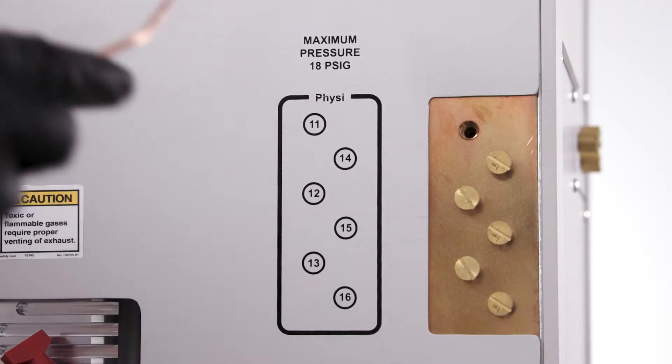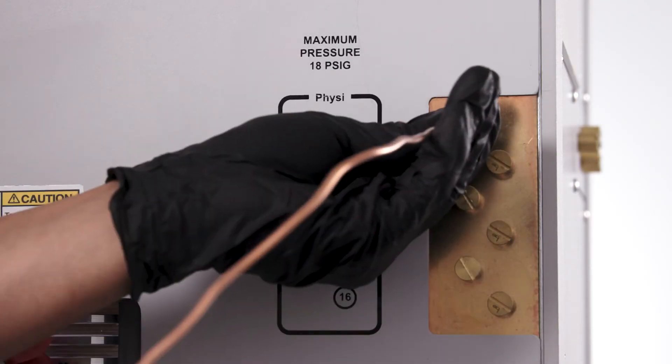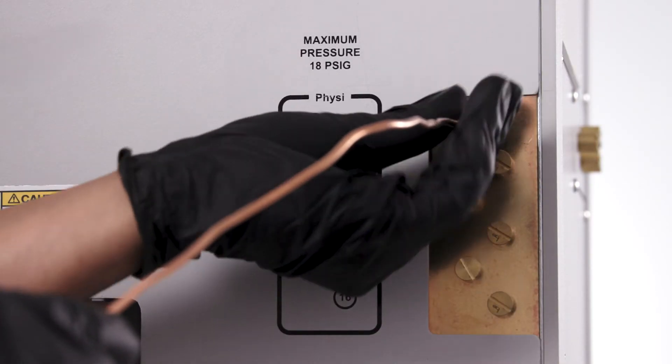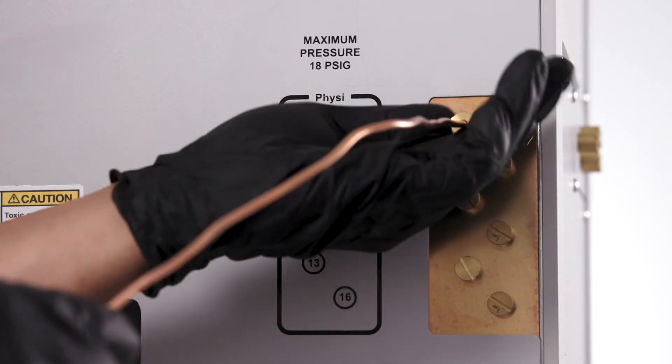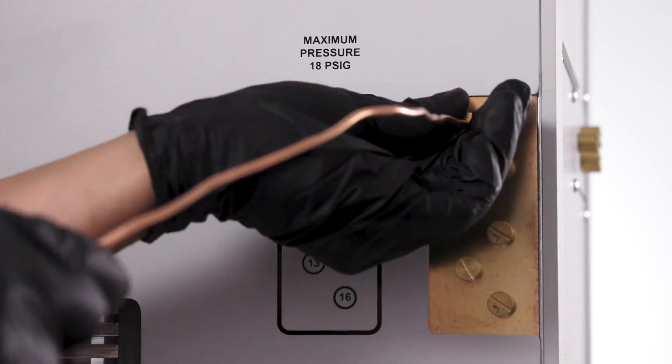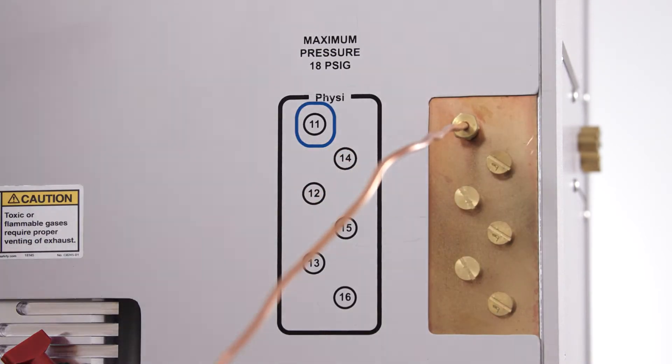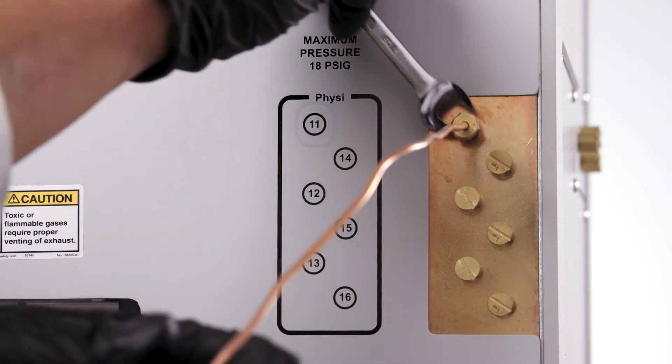The other end of the gas tubing assembly is connected to the rear of the instrument. Note the valve number where the gas was installed.